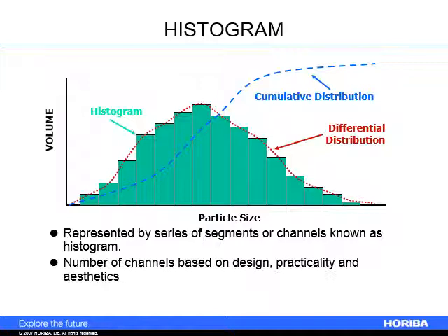You can have a cumulative distribution that relates very nicely to sieve data because sieve data is given cumulatively. You can bring it up on screen different ways. This is just to give you a sense of output. The math is actually far more of what a customer asked me for than looking at the picture.